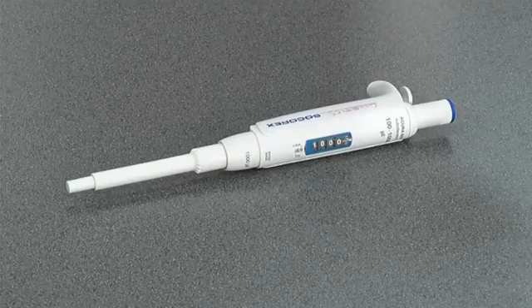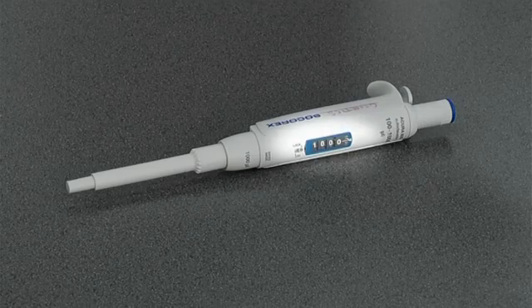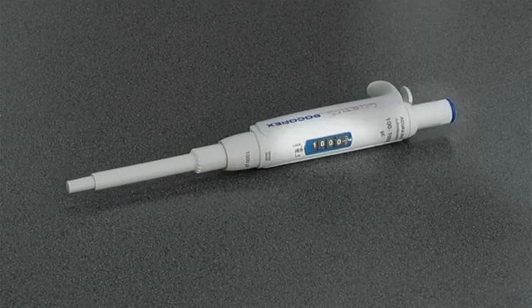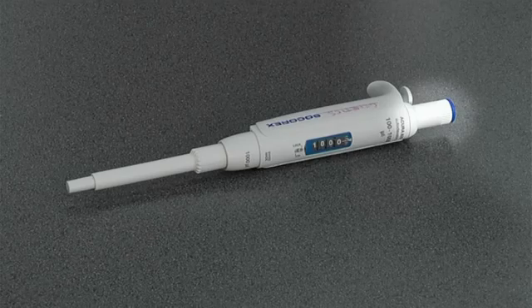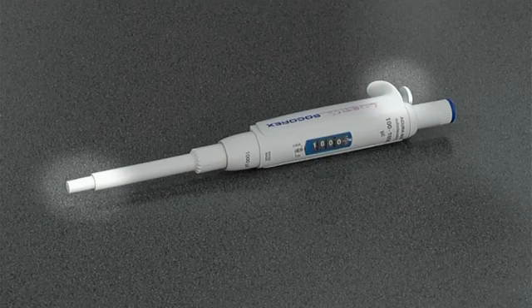Each pipette has the maximum and minimum volume in microliters it can be used for, printed on the body of the pipette. There is also a window which indicates what volume in microliters a pipette is currently set to. This pipette is set to 1000 microliters, or 1ml. The pipette is controlled by the plunger, which also doubles as a volume control. Behind the plunger there is a tip ejector, which is used for ejecting the disposable plastic tips from the end of the pipette shaft.